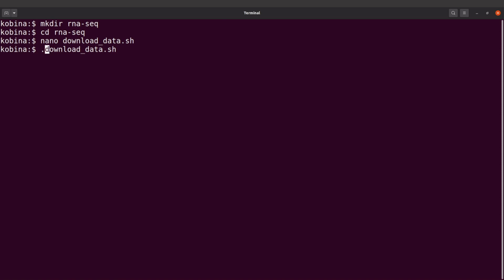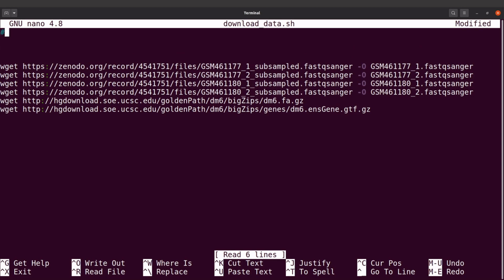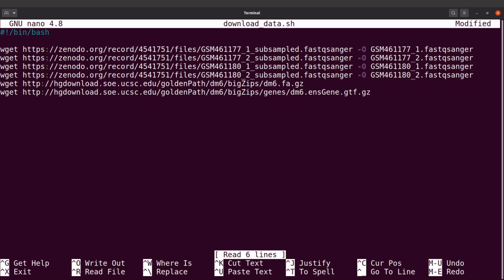So if I'm going to do it this way, then I need to modify the script again. I'll use this opportunity to show you a couple of things when it comes to writing scripts. So I'll go back again. I'll say nano. I'll edit the script here. Then the first line here, I'll say #!/bin/bash. So this tells Linux that whenever we execute the scripts, bash should be used to run the commands here. That's basically what this means, the shebang line.